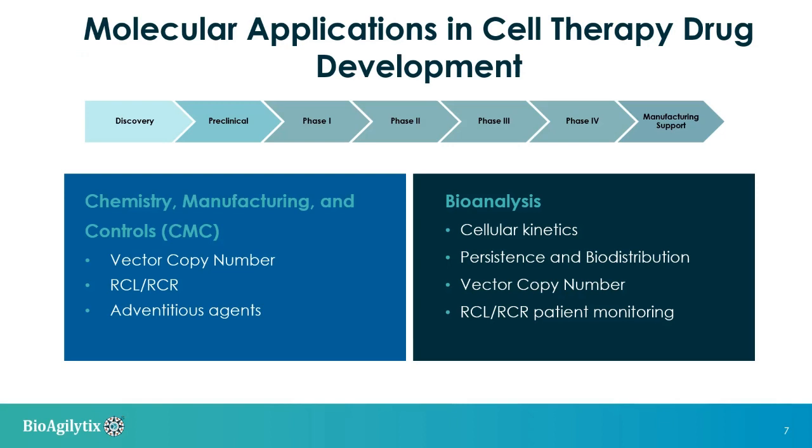And the two molecular technologies that we're going to be talking about today are quantitative PCR and digital PCR. And you might along the way see some parallels between the two. You can notice that in CMC and bioanalysis, some of these assays are used in both settings.